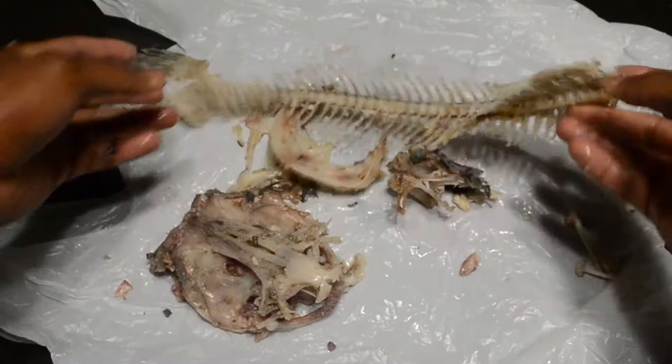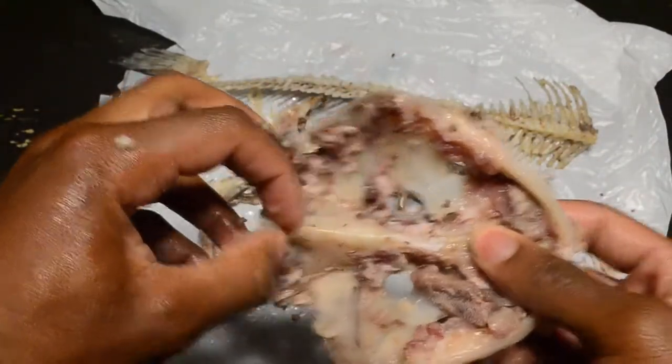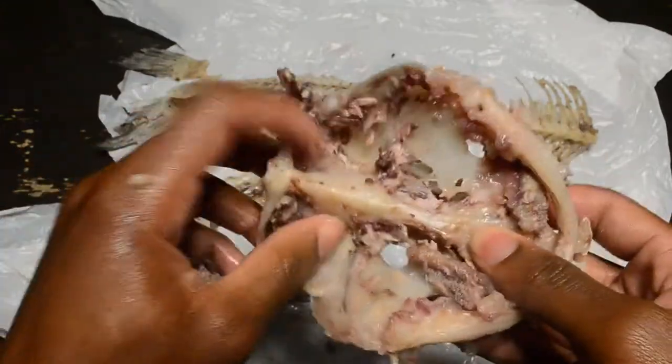If you're listening to the other video, you can see that some of the vertebrae are fused — vertebrae 2 through 4 are fused to make that complex centrum.